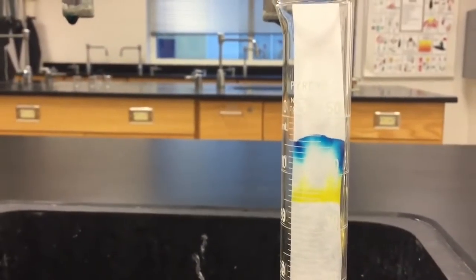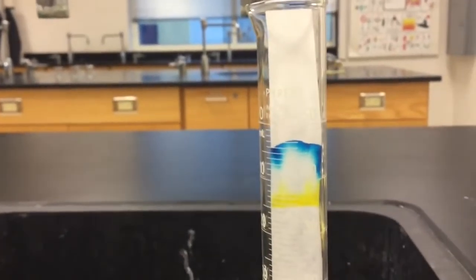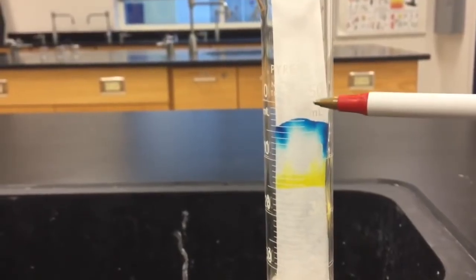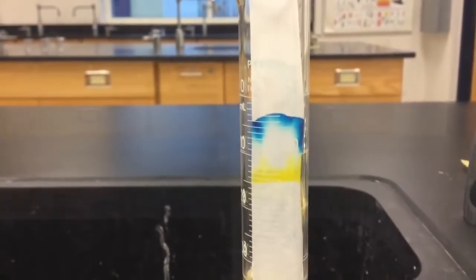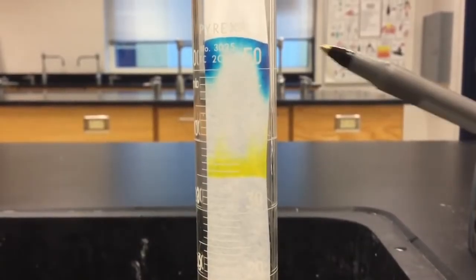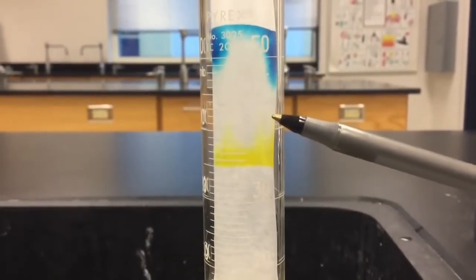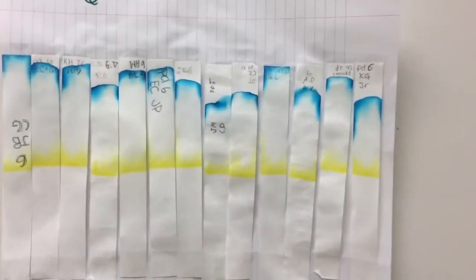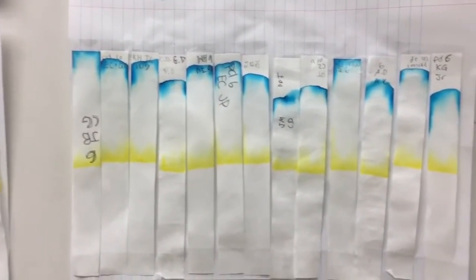Here's another look at your chromatography paper after about four more minutes. The 40 mL mark is right here and we are way past that - you can see it continuing to go up past the 50 mL mark. Now the water is done climbing. This is what the green marker looks like separated, and here are the results from the entire class of what their chromatography looked like with green Vis-à-Vis marker.